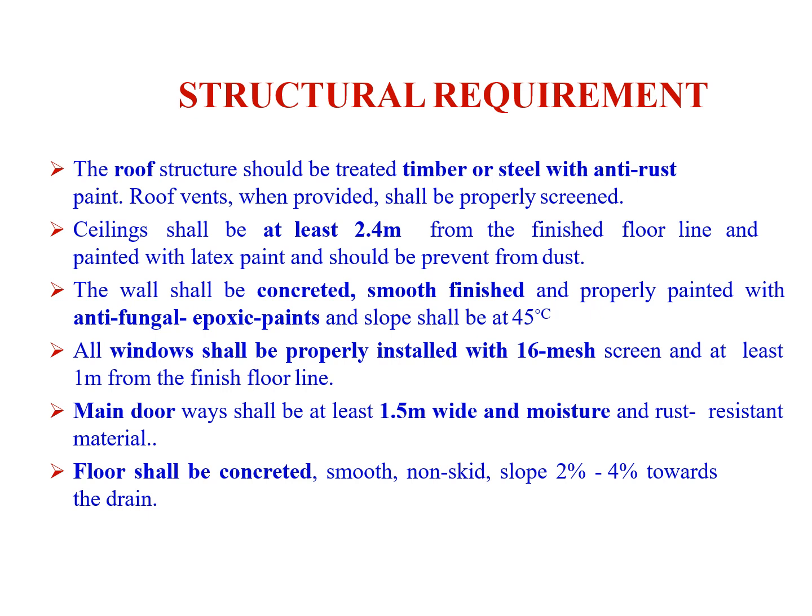The wall shall be concreted. It has a smooth finish like putty, like this. Properly painted with antifungal epoxy paints. Nowadays we have antifungal, antibacterial or antimicrobial paints. We can perform it like this.